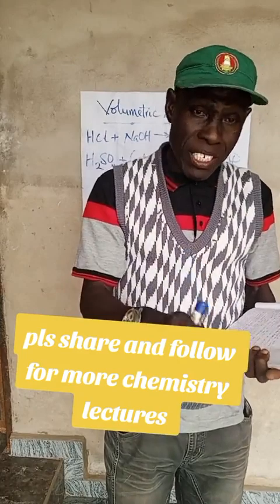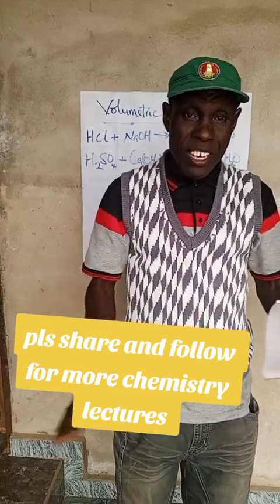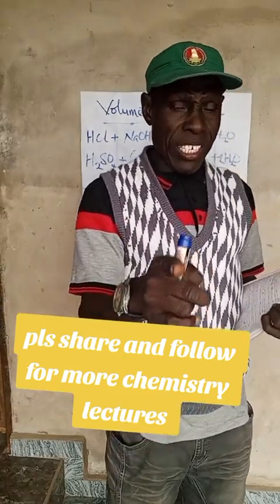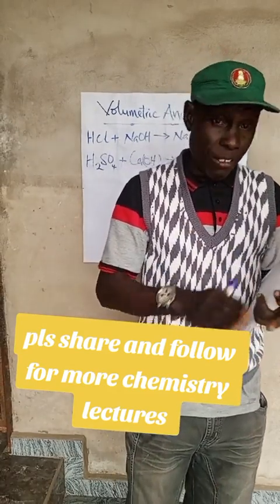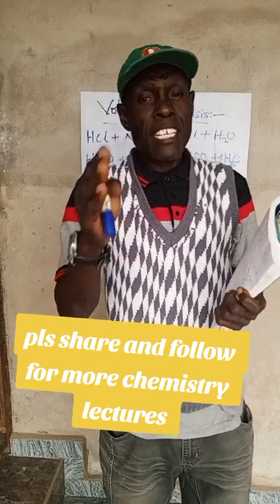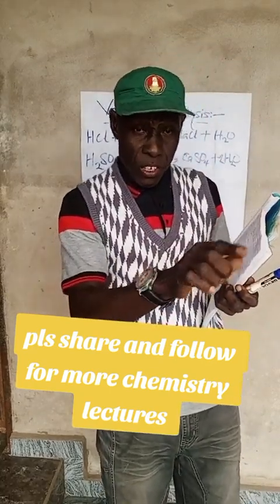Just one drop will make that pink color become colorless completely. So when it is colorless, it is an indication that the base and the acid have completely reacted and neutralized each other. At this point, you will now look at the reading of the burette.